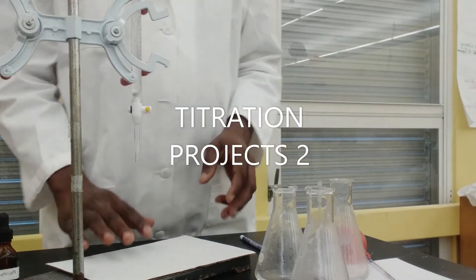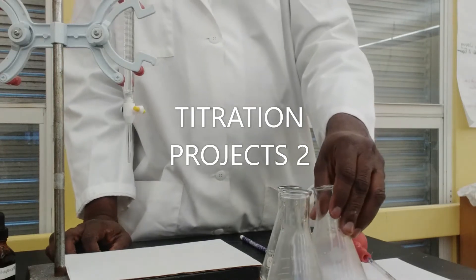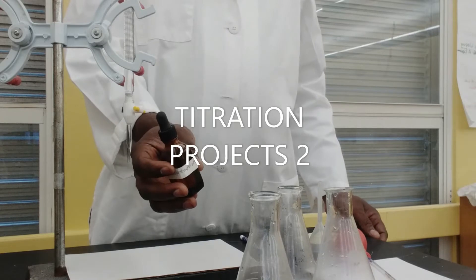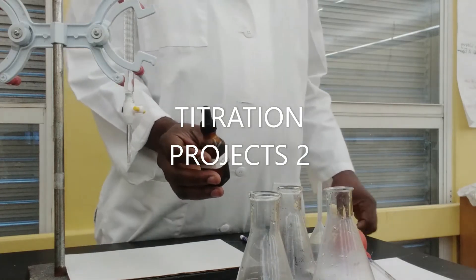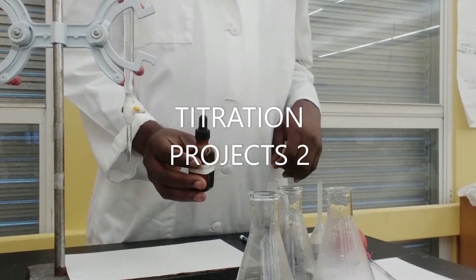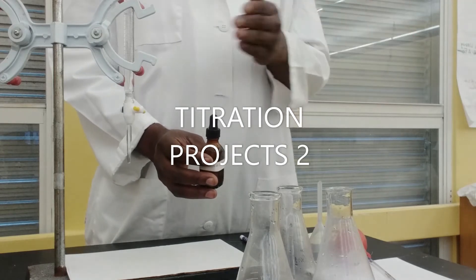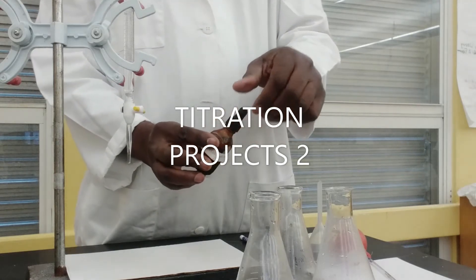Next, how do we tell that the reaction between our acid and base is complete? We would be needing what we call an acid-base indicator, and for this experiment we're going to be using phenolphthalein. Phenolphthalein is an organic compound belonging to the phenolphthalein family, and its pH range is anything from 8.5 — so at a pH lower than 8.5, that's in the acid region, heading down past 7 which is neutral, further down to zero.